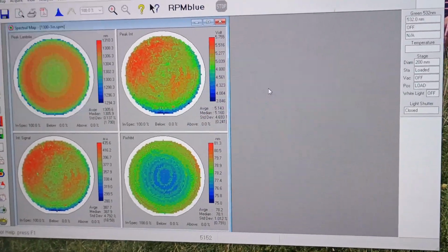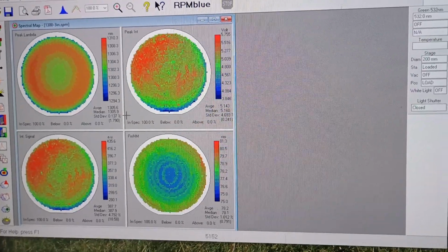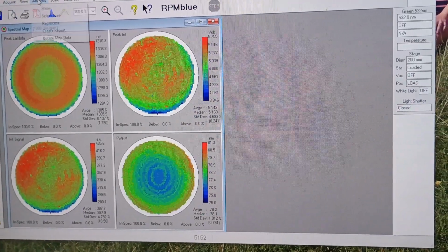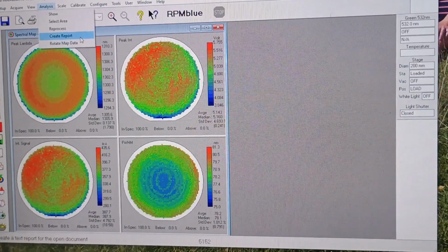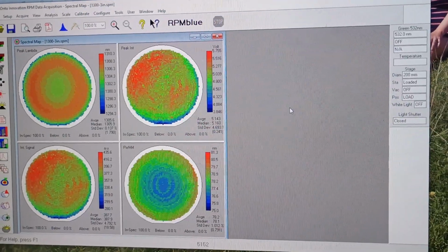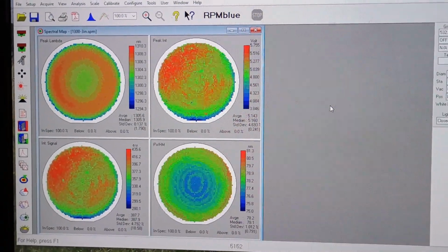We can also save it as a picture file if that's desirable. And that's the bulk of the data analysis. So the statistics in that information box would be saved as what's called a report file. So you can configure in the recipe whether we get a report file, and that's a text file with an easily parsed format. So you can retain your measurement conditions and all the statistical information there.